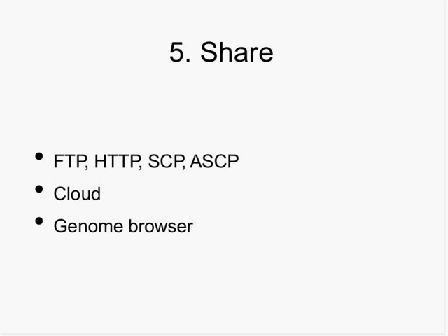You do have to share your data. Well, hopefully you do anyhow. Obviously you don't have to, but genome information, leveraging that by comparison, is a very powerful kind of approach. So the old-fashioned way would be just to host these on FTP or HTTP or some other service to allow other people to download them. Another possibility, instead of saying, hey, download this to your computer, is to put it in the cloud and give other people access to the cloud so that they can start analyzing on somebody else's computer. This is much nicer for people who are in the third world, for example. Also, hosting your data on a genome browser is a great way for people to look at it.